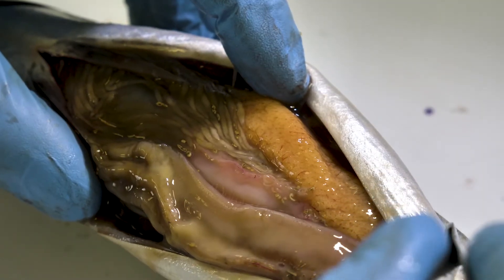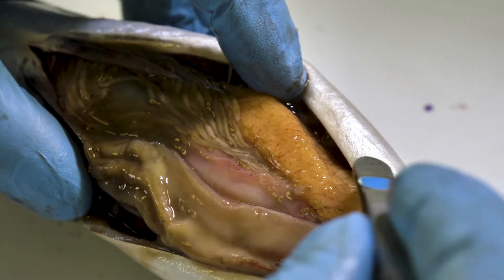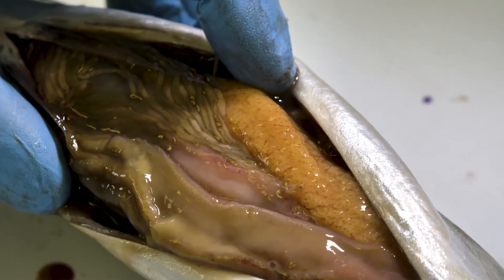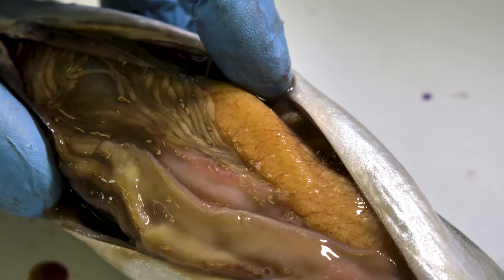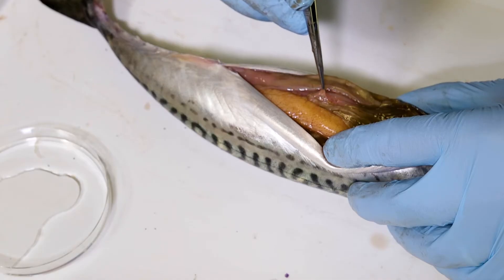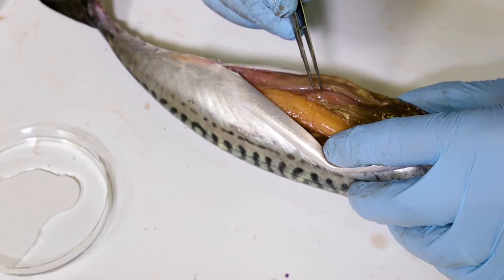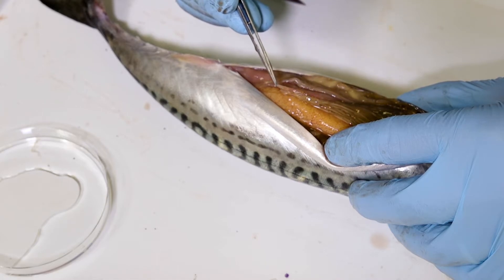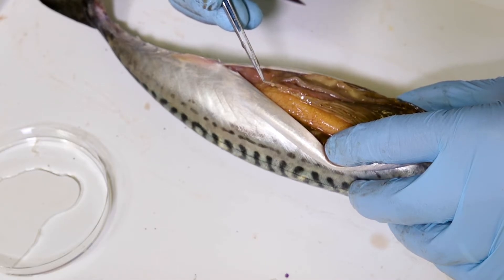We're dissecting this fish in May, and I think that is a time when the fish are spawning, so it's not surprising to find a very prominent ovary. It also looks as if this fish is quite heavily infected with Anisakis, so immediately I can see worms associated with the surface of the gut.